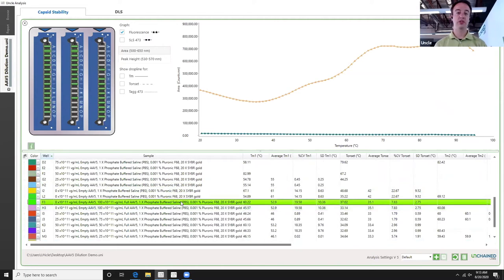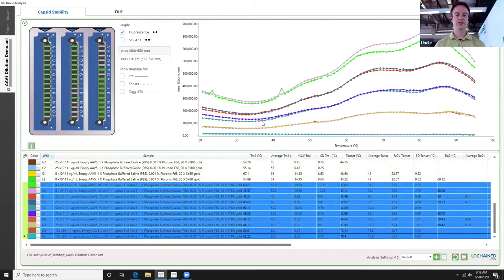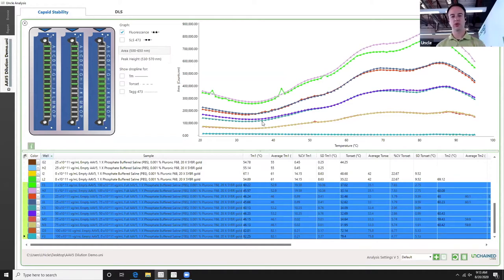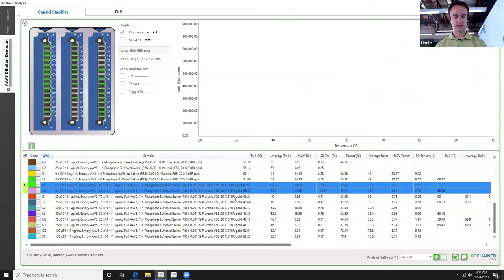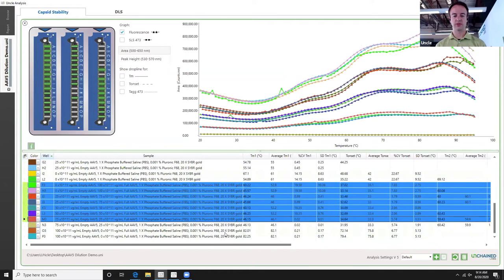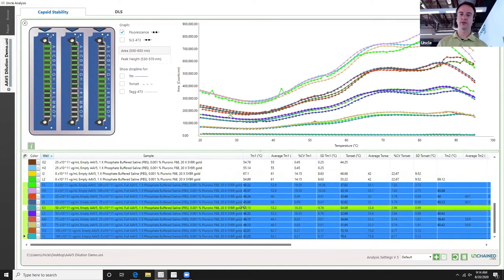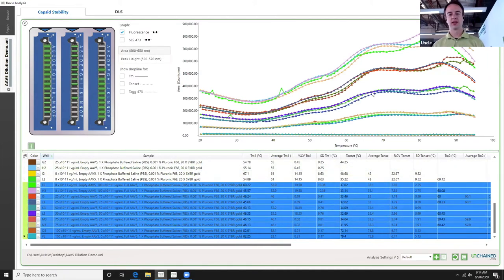Lastly, we have the mixtures of 100% full all the way down to 0% full, keeping capsid concentration constant. We notice a remarkably similar pattern to the dilution series we saw earlier — which makes sense. If we're keeping capsid concentration constant and decreasing the amount of DNA in each sample, where this is the highest percent full and this is the lowest percent full, we're really just looking at the behavior of constant amounts of DNA. Overlaying with our other samples, we see that completely empty capsids align with buffer controls, and a 50% full capsid aligns with results where we had the same number of genomes in a previous experiment. That's fluorescence and SLS data being used for AAV capsid stability.